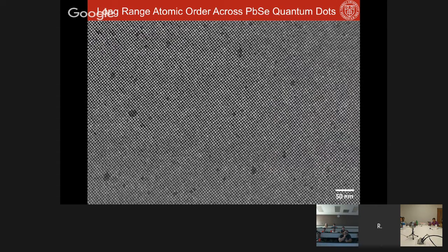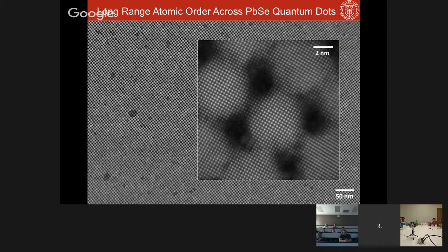So these aren't atoms, right? These are nanoparticles, and they're ordered in a way that allows you to tune the optoelectronic properties. With aberration correction, we can look at the long-range order of these particles, but we can also zoom in and see the atoms and the connectivity between these particles. In this image that I'm showing, those dots are the atoms, and the larger dots are the nanoparticles.